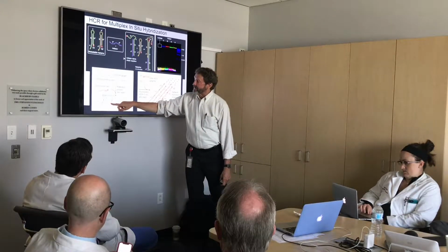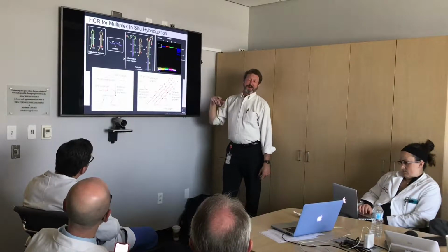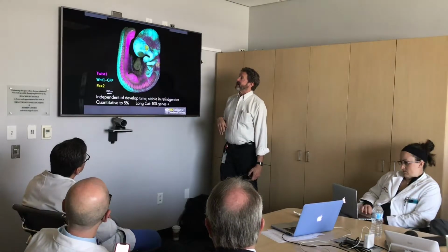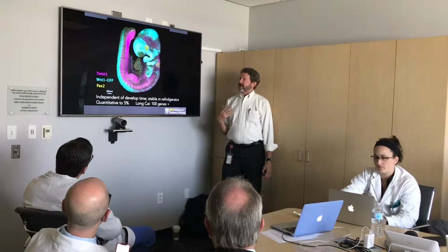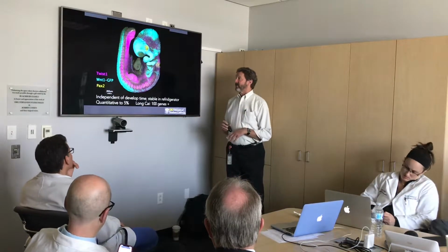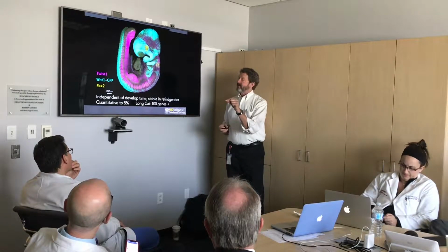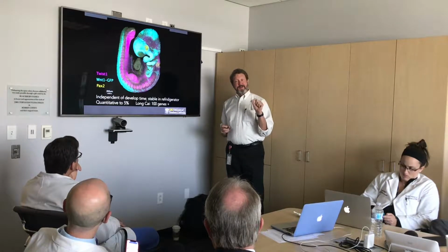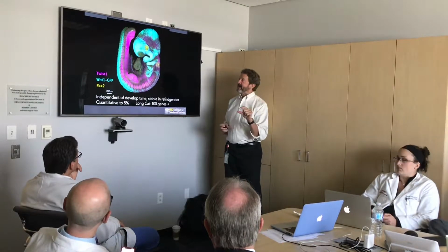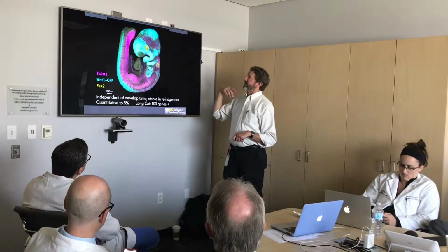And so we take advantage of that by putting these initiators onto the antisense probes. And now what you've got is a number of dyes on a leash. It's about a 200 mer that forms in this case. And what that does then is it gives you enough signal to see the gene product where it's localized. It doesn't matter how long you develop it, the hairpins diffuse into the tissue. So unlike my old life of trying to figure out which gene had to be developed for 32 minutes and which needed to be for 4 days, you throw the reagents in. In fact, this one spent 2 months in the refrigerator before it was photographed.